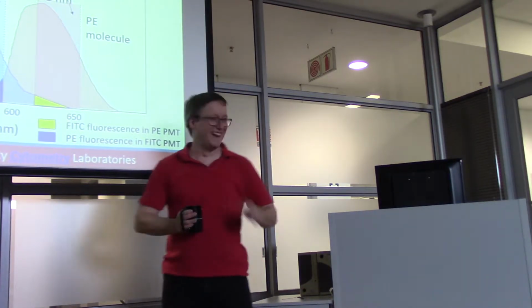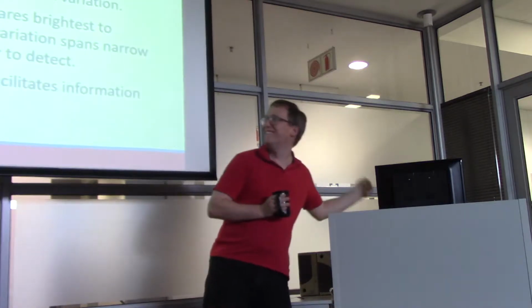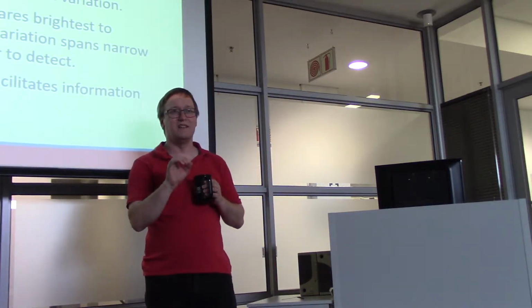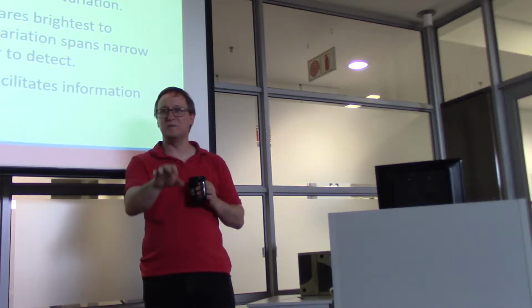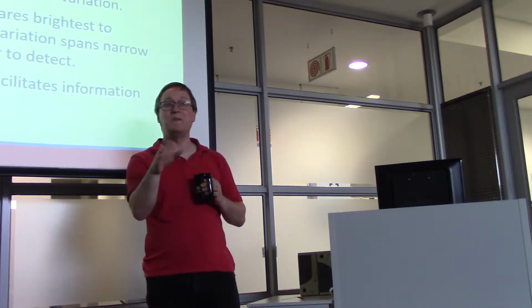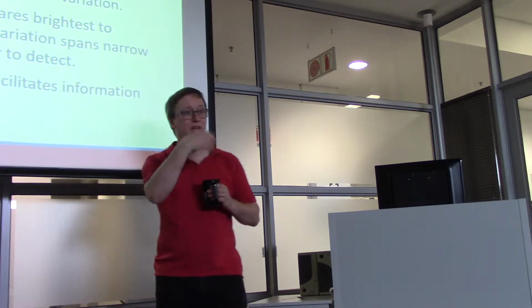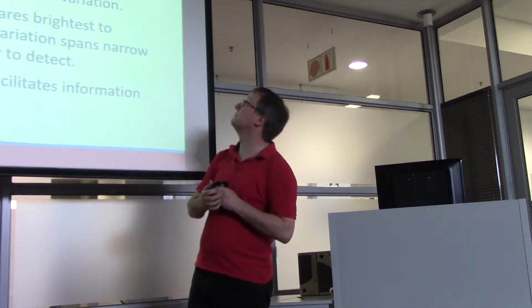So, anyway. In the same way, when we have multiple fluorescent dyes that are all communicating in the same sample, it's possible that one may mask the other because they have some overlap in their fluorescence emissions.